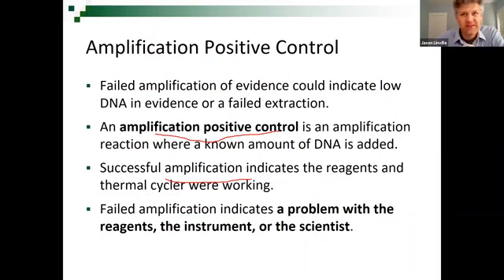They tend to have funny names. K562 is a cell line, 9947A is a cell line, 9948 is a cell line. They have these different cell lines, and then they just extract the DNA from them. When you buy 9947A today, you get a profile of a certain 13 pairs of numbers, and when you buy that cell line 3 years from now, it's the same profile with the same 13 pairs of numbers.